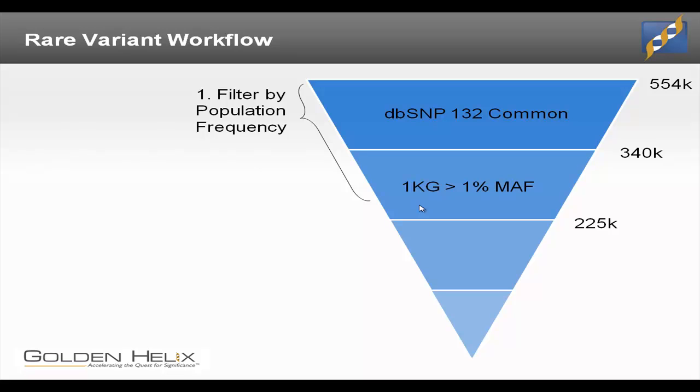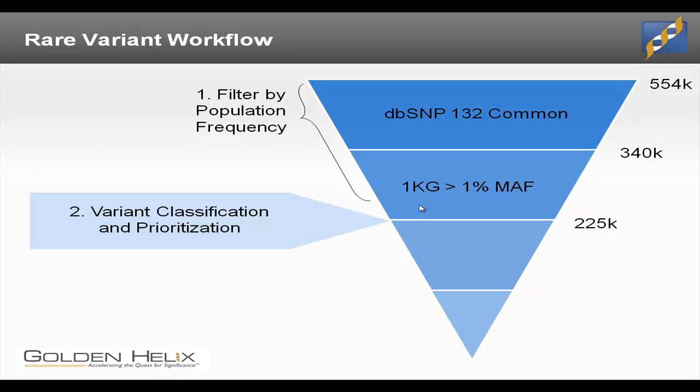So we're going to do that as our first step, and we're going to reduce that 554,000 down to 225,000 variants. As our next step, we're going to use our new variant classification feature. That's going to help us prioritize those remaining variants, and we can even do any number of workflows from this point to look at high priority variants or variants of a certain class of damaging variants.